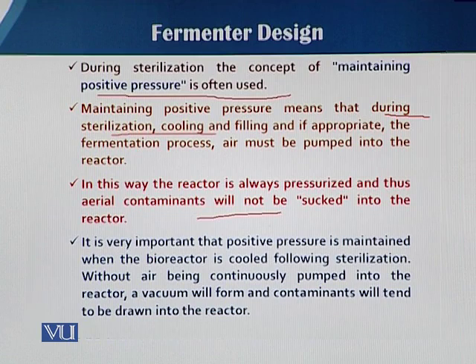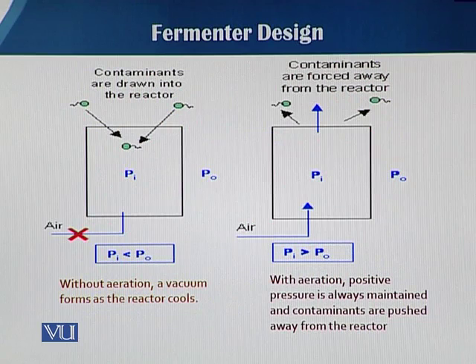When there is heating, there is expansion, and when there is cooling, there is contraction. So while expanding and contracting, there is a suction of material. That's why there is a chance of contamination. Due to the small vacuum that is produced, sometimes different gadgets which are attached to the surface plate can have some leakage. So if there is a positive pressure, then there is no risk of such inward entry.